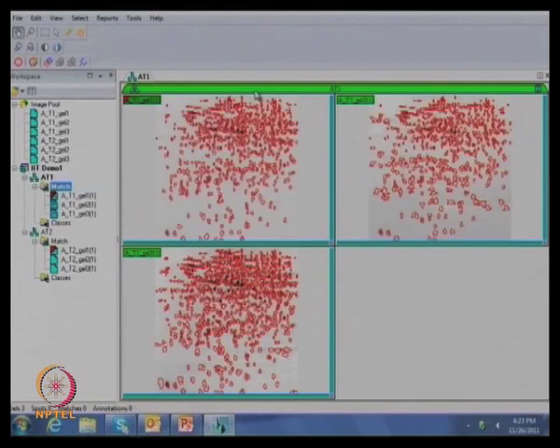So all the 3 parameters one can accept, and then detect the spots. Exactly. That is what the software is detecting, the spots. Now it has detected all spots in this gel. If you are satisfied with this particular detection, then it's fine. Otherwise, maybe we should zoom into a region and see. Yes, exactly. I'm going to do the same.